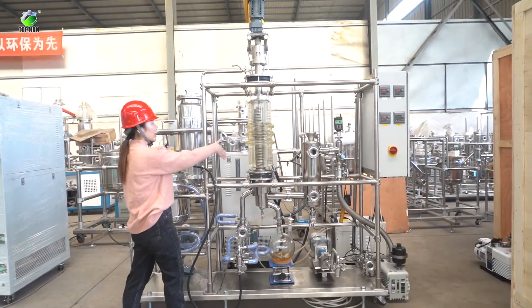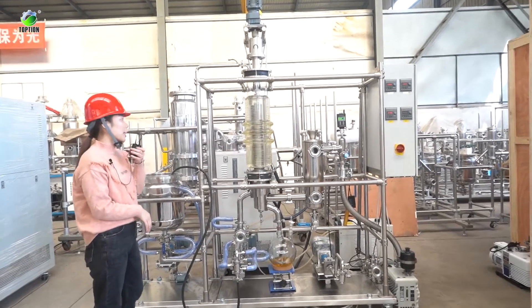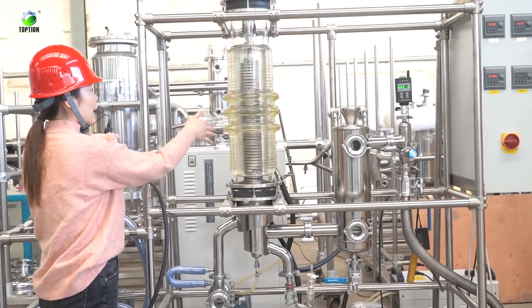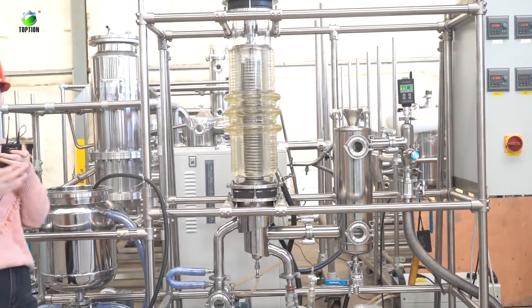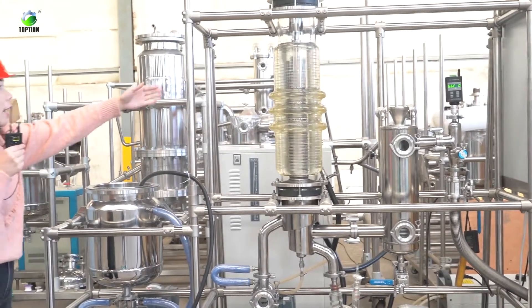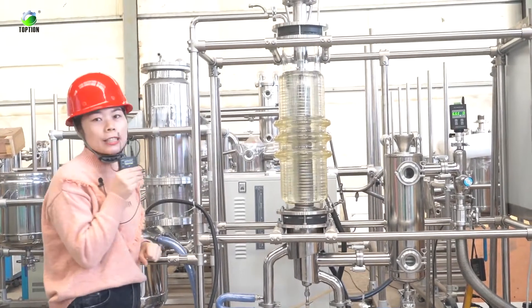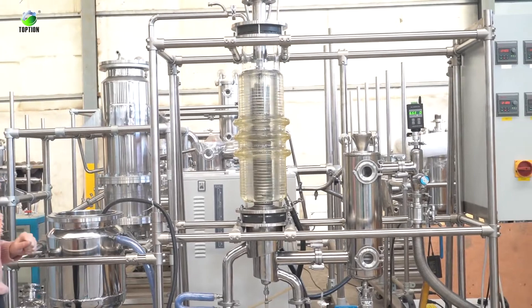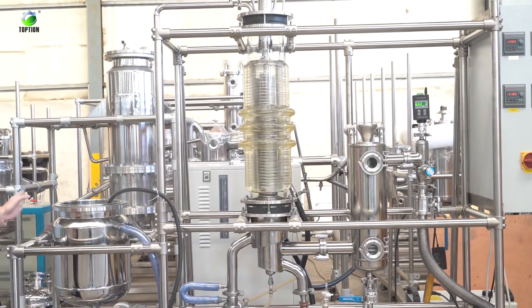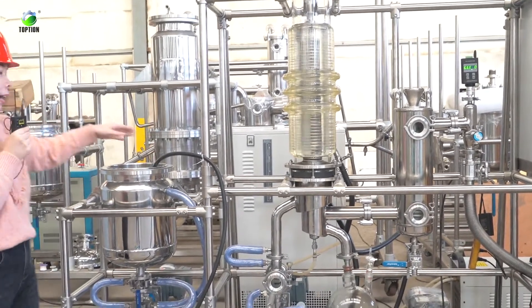This unit is made of glass material so you can see all the motors inside the condenser here. The whole side is the main evaporator, which is 0.25 square meters. We start from left to right here.